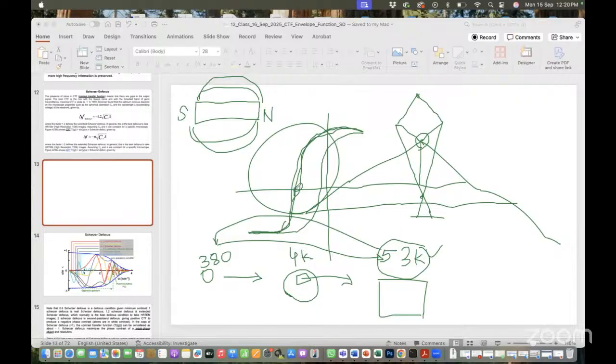There is nothing that you have to do in a microsecond time frame or nanosecond time frame, right? So you inserted the grid, now you wait, the thing should be stabilized, the mechanical drift will be less. Then you have a low magnification, you selected some area, then go to medium mag, then SA mode. When you are in SA mode, you go to one particular magnification and then do it. So there is nothing that we have to do in a very fast mode. And if you follow that, most of the time that lens hysteresis problem will be less.